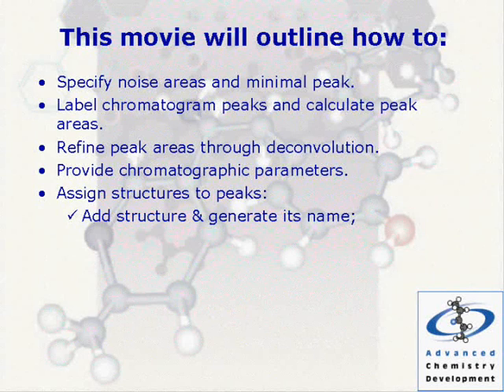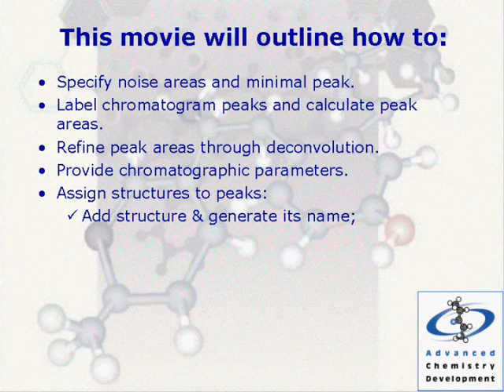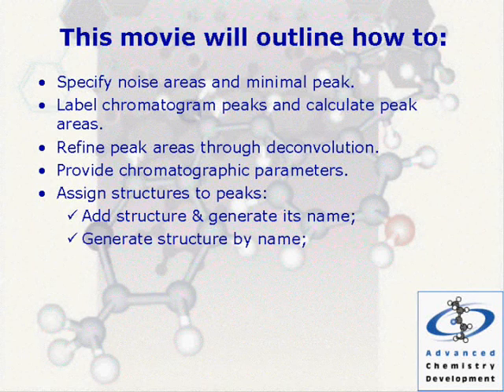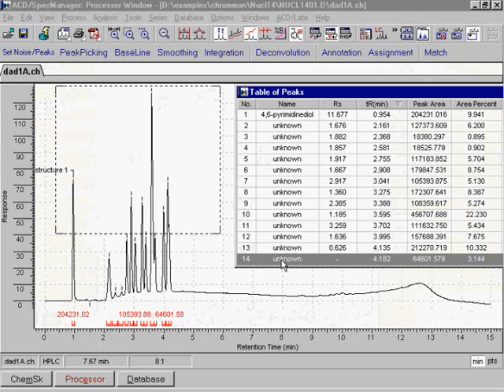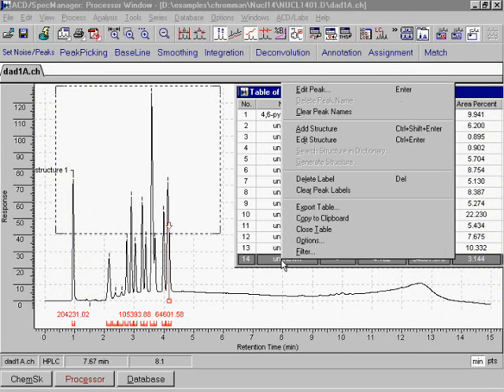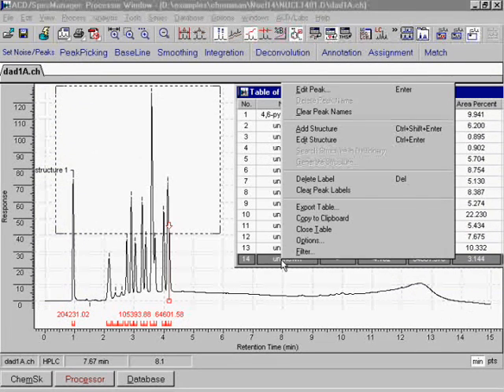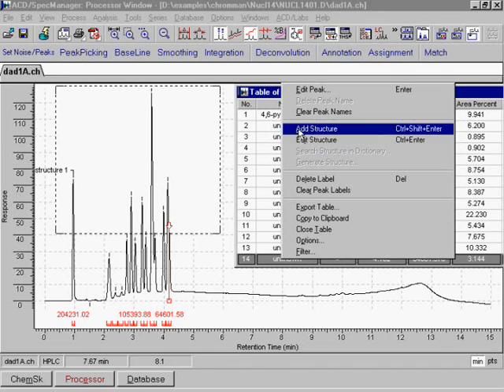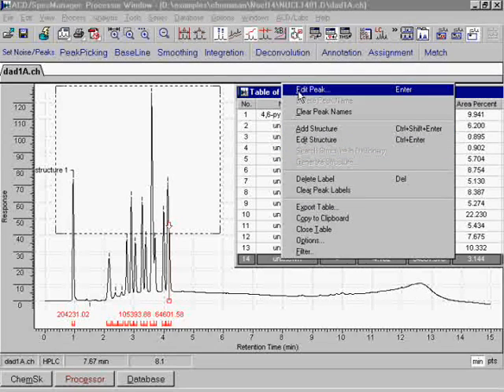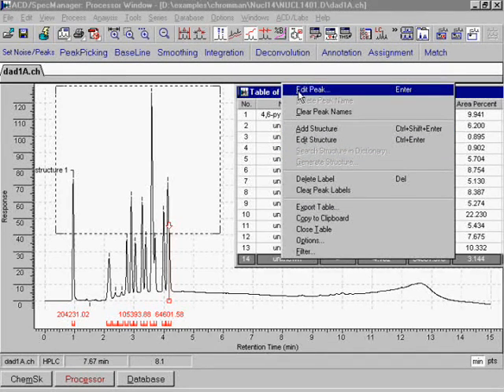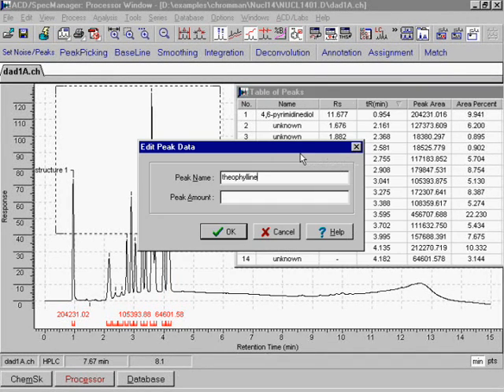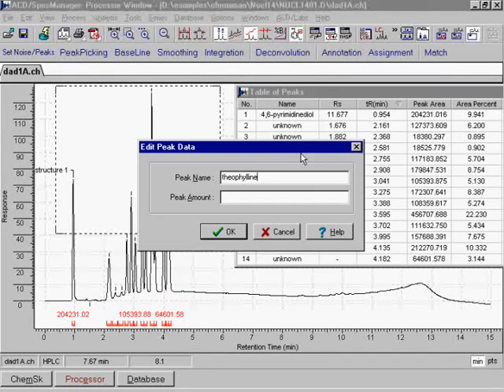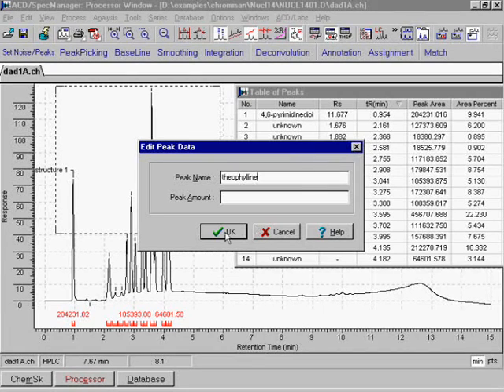Generate structure by name. For the last peak from the table of peaks, we input the compound name, theophylline, and generate a structure for this name.